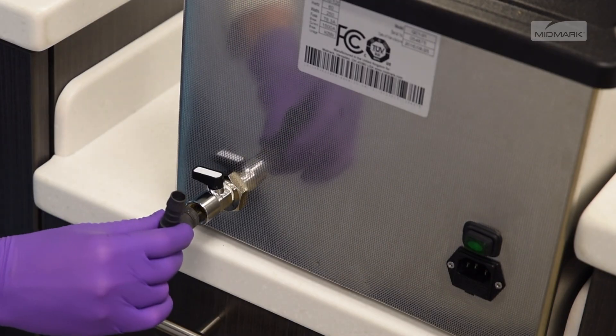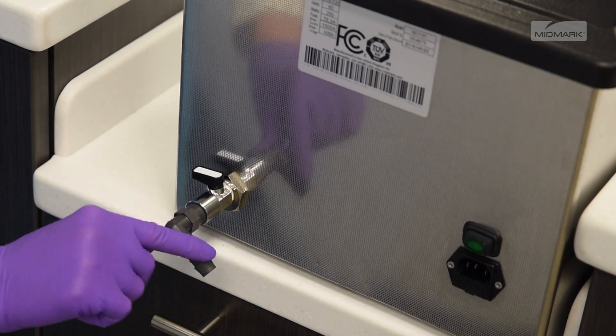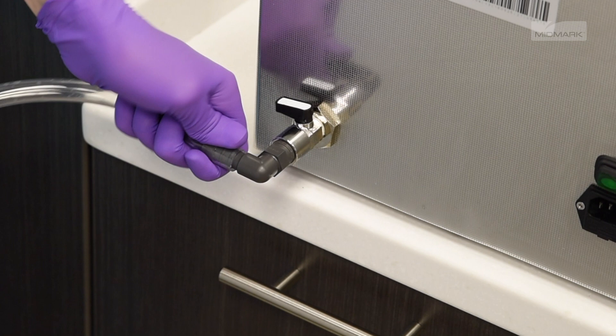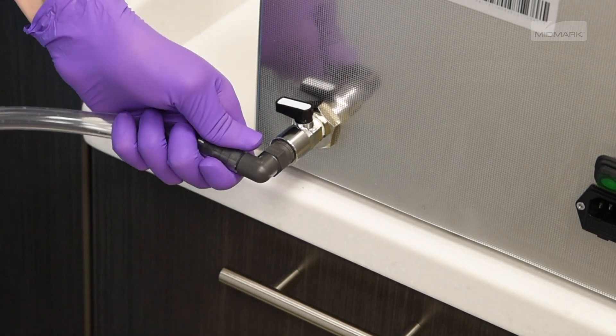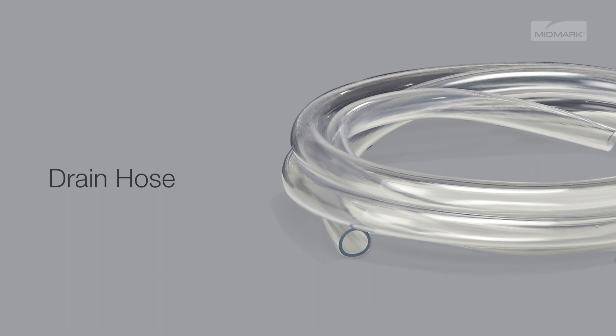To assemble, screw the hose connector tightly into the drain valve at the rear of the unit. Next, connect one end of the drain hose to the hose connector. Be sure the hose is tightly fastened. Next, place the other end of the hose in a bucket or sink. Your QuickClean unit comes with a drain hose to reach the sink or bucket for easy draining.